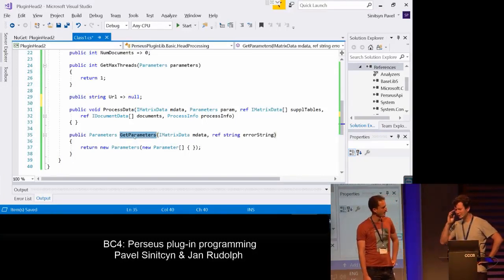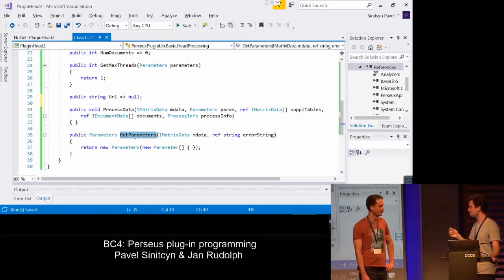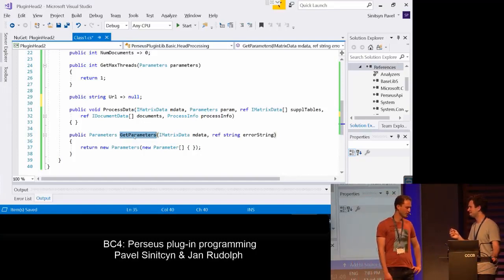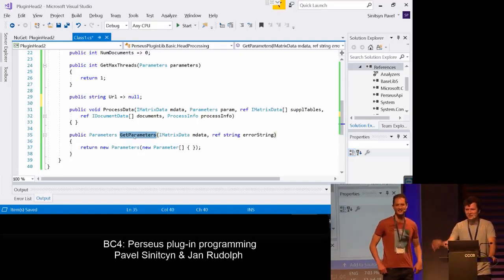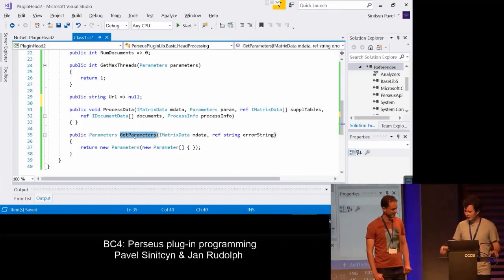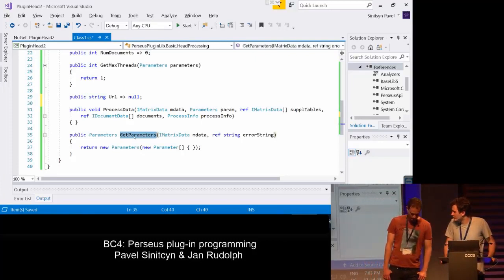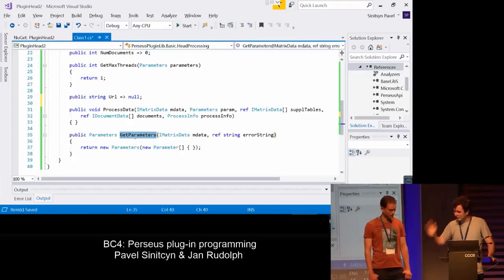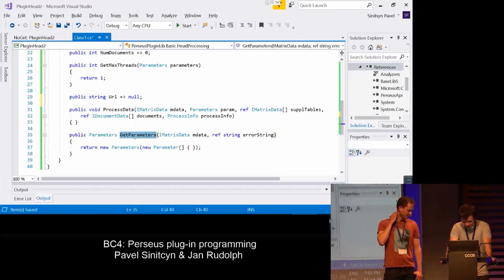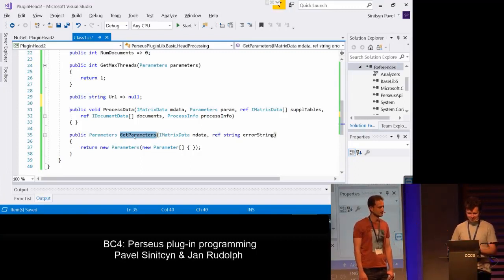I want to come back to one thing that many people write in the Google group, which I really don't like: writing that they install MaxQuant. Do you know why it's wrong? Because you just copy it and then you run it. There's no installation process, like when you are heavily compiling everything from the code. That's true for languages like C, but it's not true for C# or Java, because you're just running it on your machine and not installing anything. It was a small outlier.